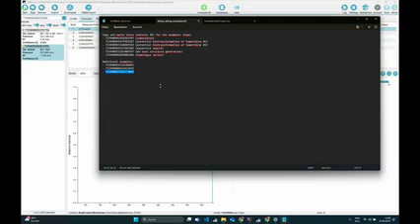If I may have another one. Yeah, sure. At the beginning you briefly mentioned the sensitive mode, because we are also many times interested in very low abundance compounds. So what does it do exactly if I choose the sensitive mode?